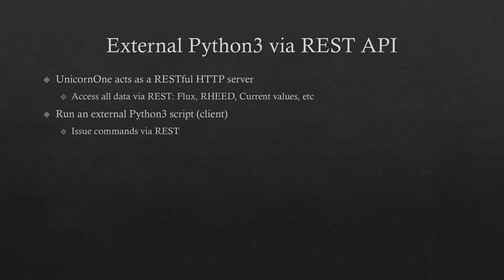It also means the AI application no longer needs to run inside UnicornOne at all. It could run on the same computer, on a dedicated GPU workstation, on a local server, or in the cloud. Now let's look at the REST API.